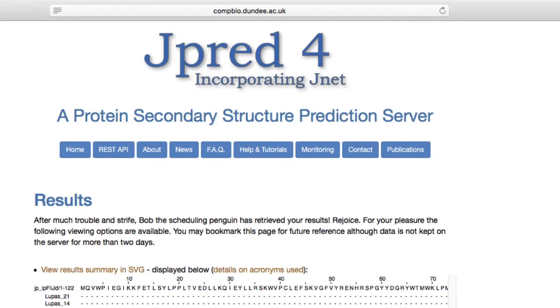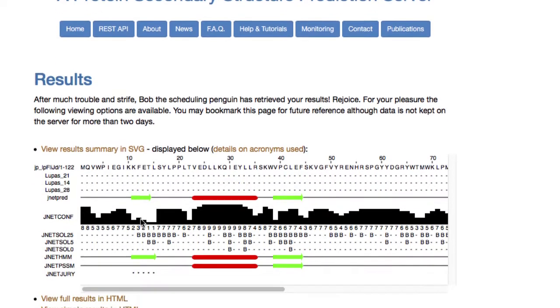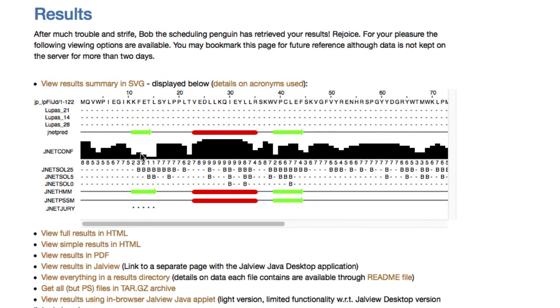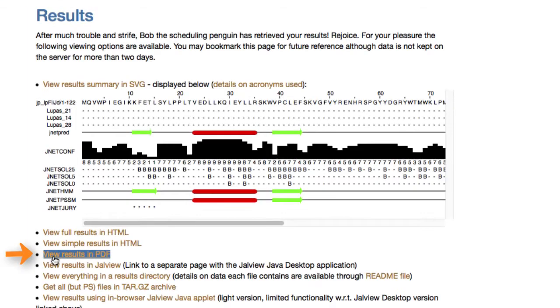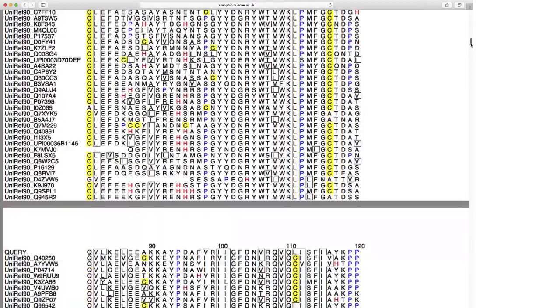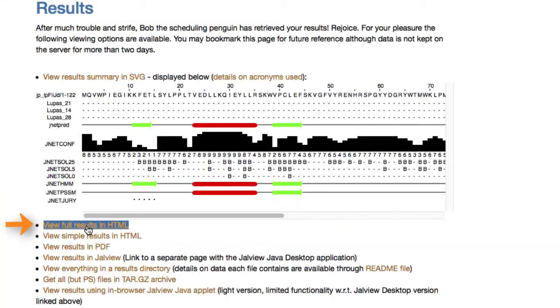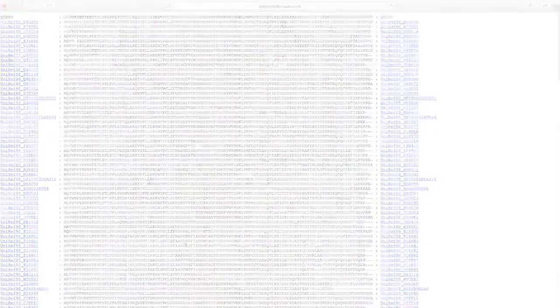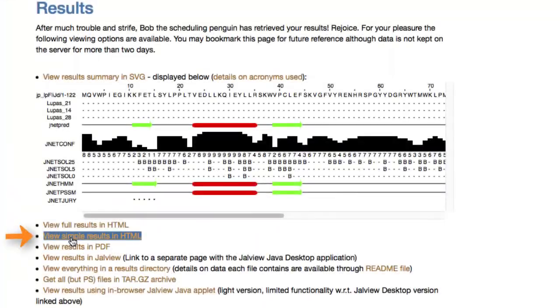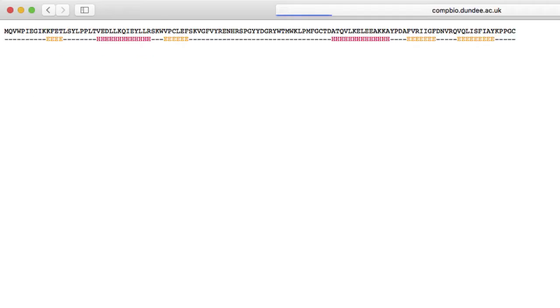After a while, the results are displayed on the JPRED webpage. The results can be viewed and saved as an SVG or PDF. The full results can be viewed in HTML. Alternatively, a summary can be viewed in HTML.